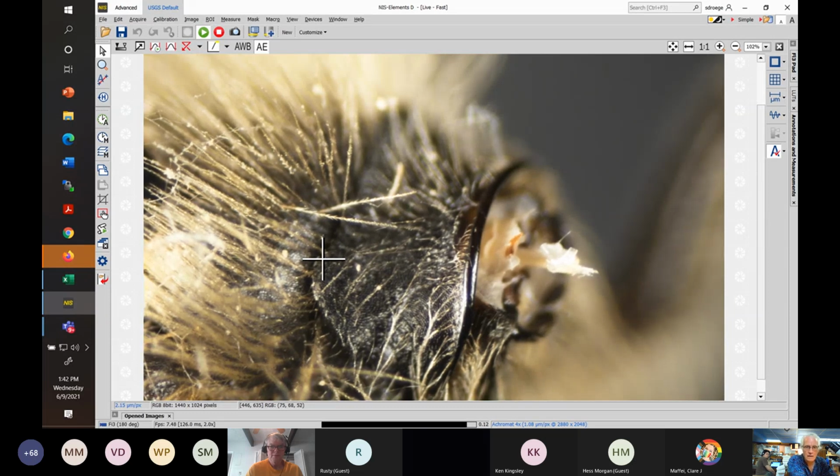So you have this kind of situation. And let me get this a little bit more in focus. I'm glad I got this bigger crosshairs. Not super great, but see this right here? It's actually, if this had a smooth cornerless pronotum, you would not see this line here. So there's like ears sticking out or projecting a thin leaf, you might call it. Lamellate might be a word that you would use if you want to be fancy. But this is clearly not conforming. And this edge often runs down like this and forms a ridge across the pronotal collar.